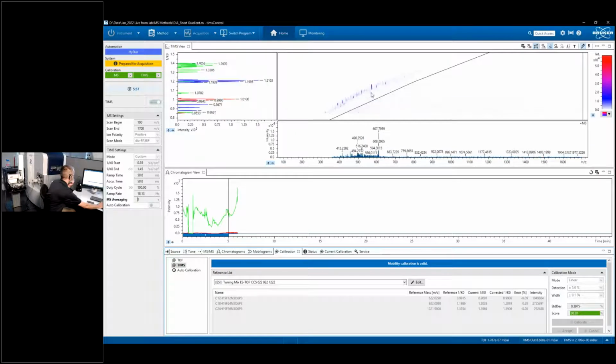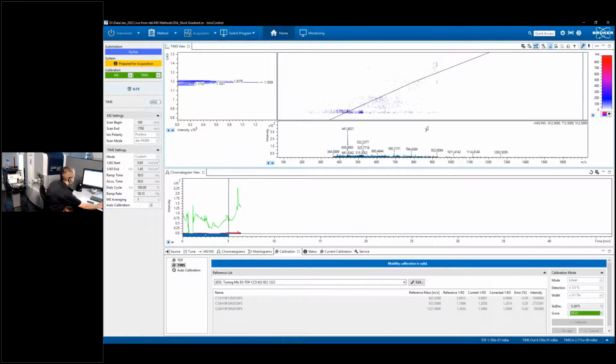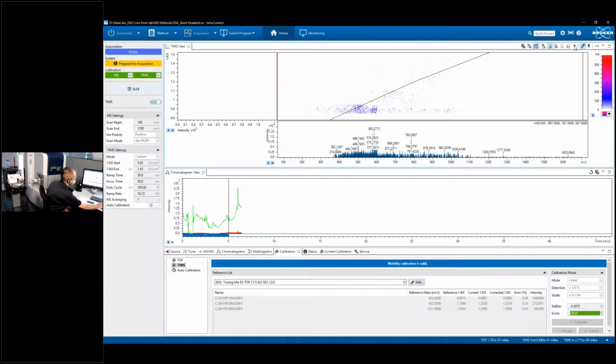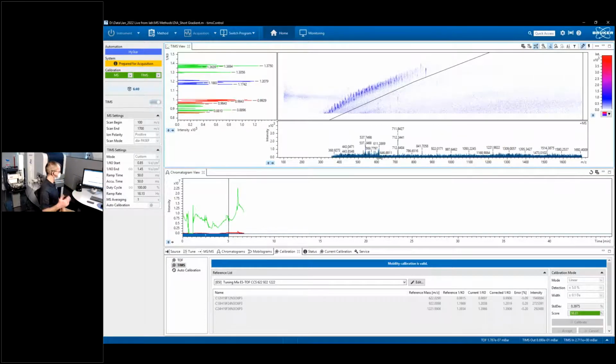By the way, the system's still loading the sample, but what you'll see here in real time is these ions here are the singly charged data that we saw earlier, and you can just start to see some peptides starting to elute here, right? So here's some of the peptides, and you can see they're well separated from the singly charged data here. This is only showing MS1 data. I can change it to MS2 data, but the system is really quite fast, and it probably doesn't really show it to what you expect to see. So I think this is probably a better view of what's happening. Every time you're seeing here is a new MS1 spectrum after having run through all of those windows.